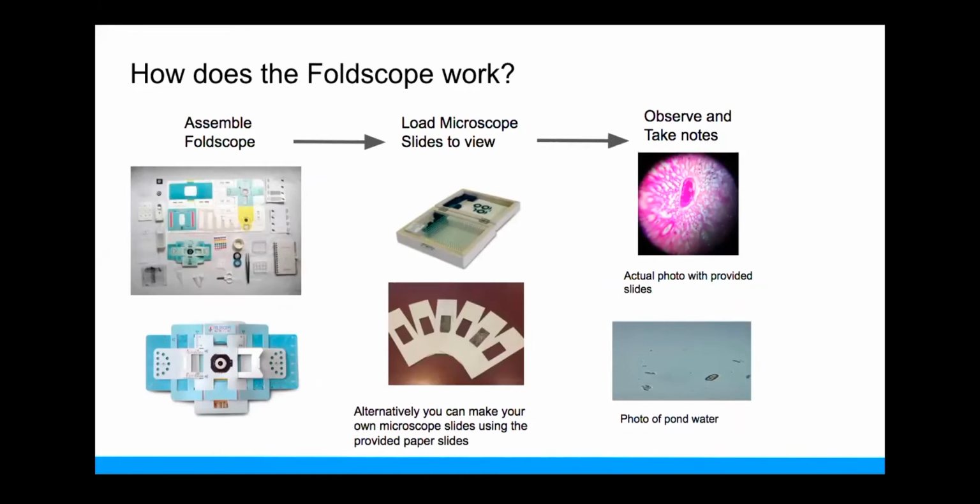As you saw earlier, you know what a Foldscope is. However, you're probably wondering how it works. Here in our first image, we have our Foldscope before it is fully assembled. After assembling our Foldscope, it will look like the bottom image. Next, we will load microscope slides onto the Foldscope.